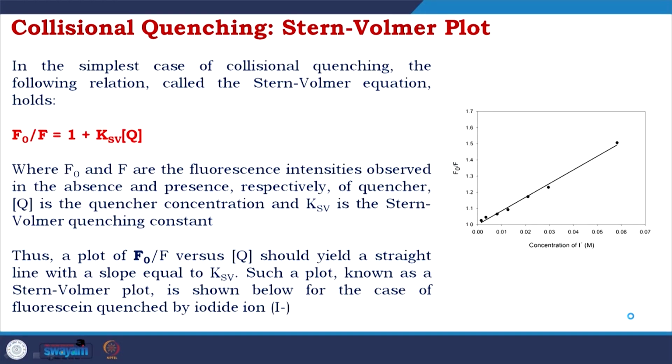How? In the simplest case of collisional quenching, the relation is called the Stern-Volmer equation.